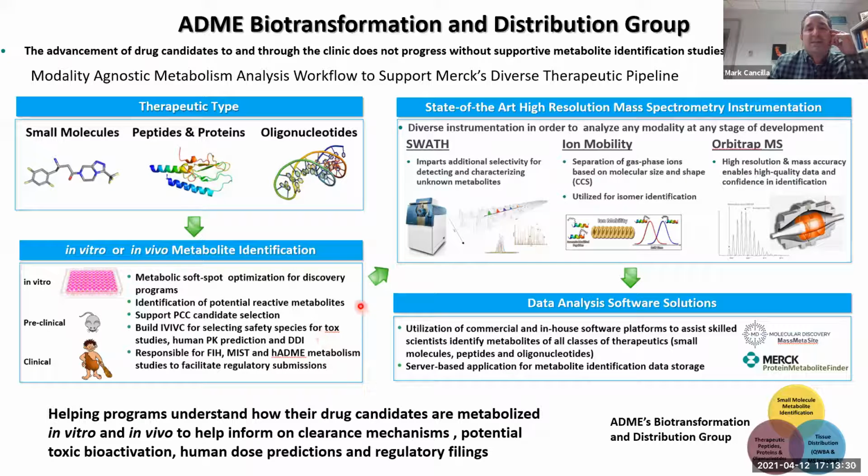As Joe can attest to, we have a whole range of instruments within the group. We have a lot of fun toys. So we have SciEx instruments to do SWATH. We have multiple ion mobility instruments from multiple vendors now. We have multiple Orbitrap instrumentations.